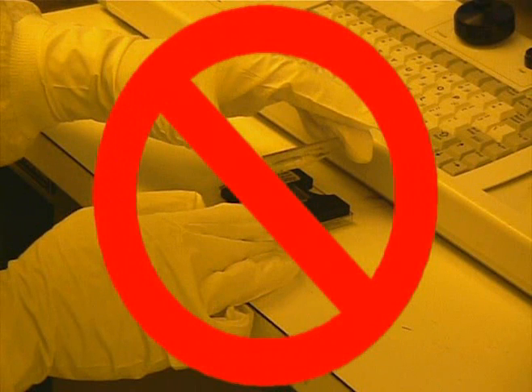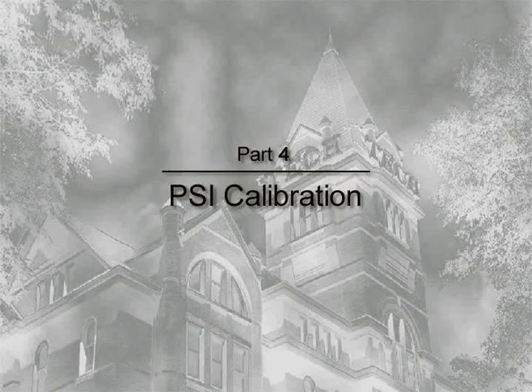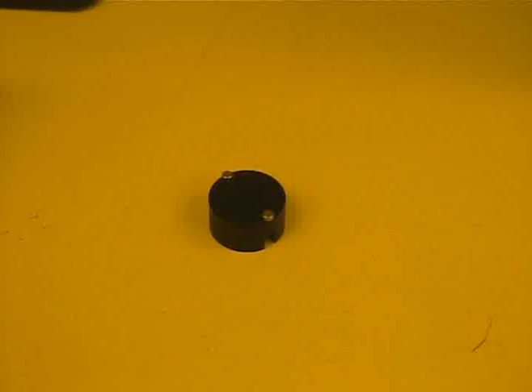Be sure to place the sample face down on the buttons. This is a PSI calibration sample. We keep the sample covered to prevent damage.